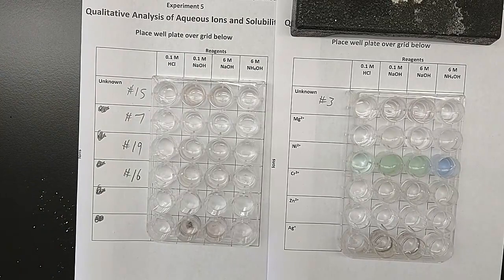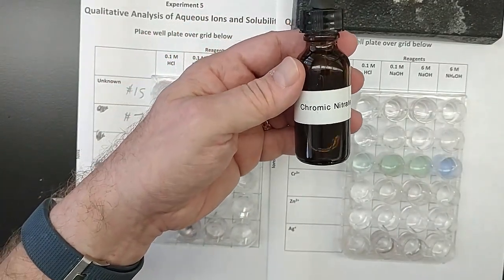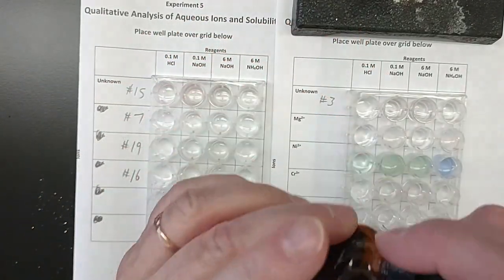Moving on. Chromium. Find one. Here we go. Chromium 3, also known as chromic nitrate.